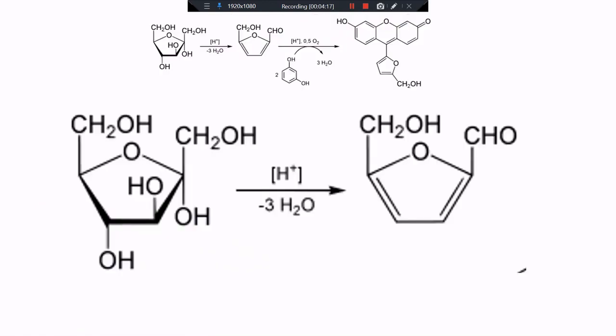These are the reactions. We have a carbohydrate in the presence of acid, H plus, which is dehydrated and gives furfural. This furfural reacts with 2 molecules of resorcinol and gives this complex. This is the first step: the carbohydrate is dehydrated in the presence of acid to give a furfural derivative.